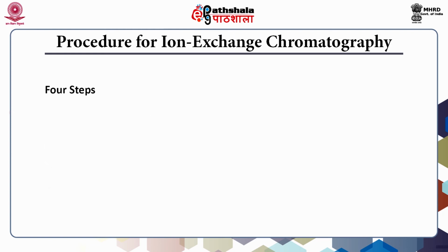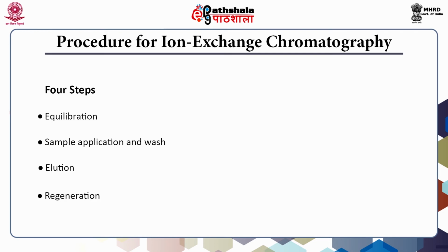There are majorly 4 steps in ion exchange chromatography when we perform the experiment. The first is equilibration, the next step is sample application and wash, the third step is elution, and the final step is regeneration. Let us discuss these steps one by one in the coming slides.